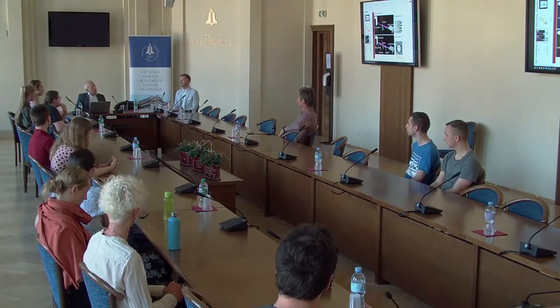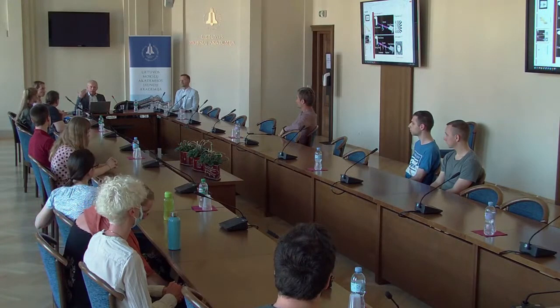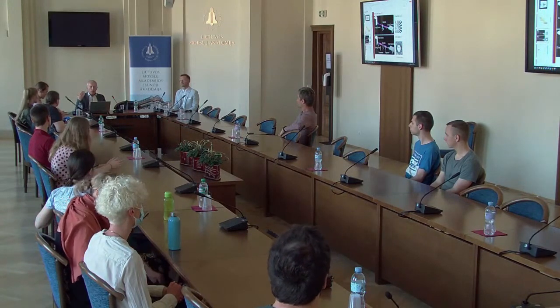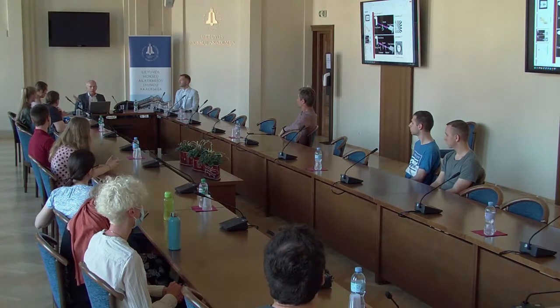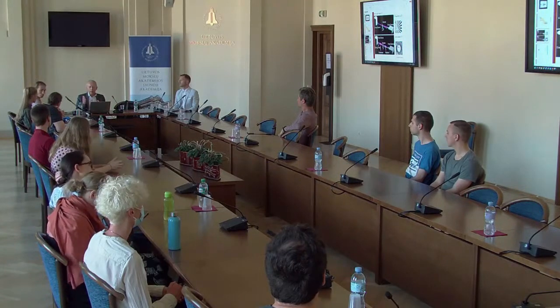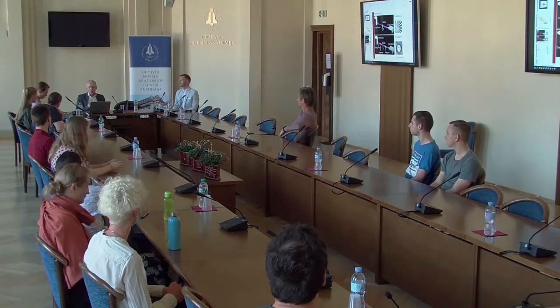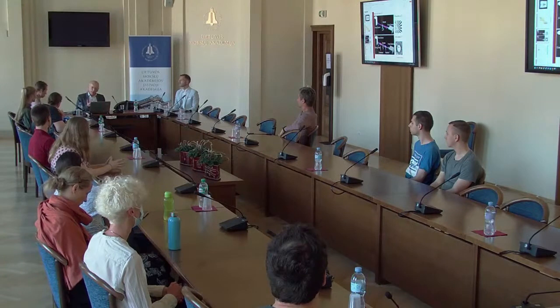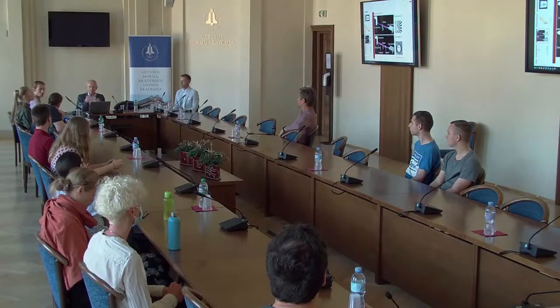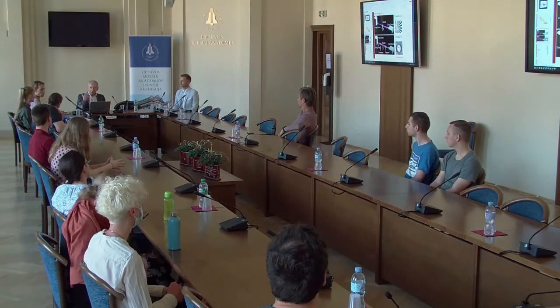Su nano-CT, kaip šitas aparatas, sakiau, čia reikia turėti monochromatinį šaltinį. Monochromatinis šaltinis naudoja tas charakteristines linijas. Jų nėra, sakysim, 30 kilovoltų; reikia labai sunkių metalų, kad 30 kilovoltų būtų energijos charakteristinė linija. Tai dažniausiai naudoja varį, molibdeną. Varis turi 9 kilovoltų liniją, molibdenas gal 17 kilovoltų liniją. Tai jeigu yra 9 kilovoltai ir įdedi visą dantį, tas rentgeno spindulys tos energijos nepereis per dantį. Nieko nebus. Tą dantį reikia tada mažinti, pjaustyti, išpjauti 2-3 mikronų bandinį ir jį galima prašviesti. Tai čia yra problema su šitais. Jo.